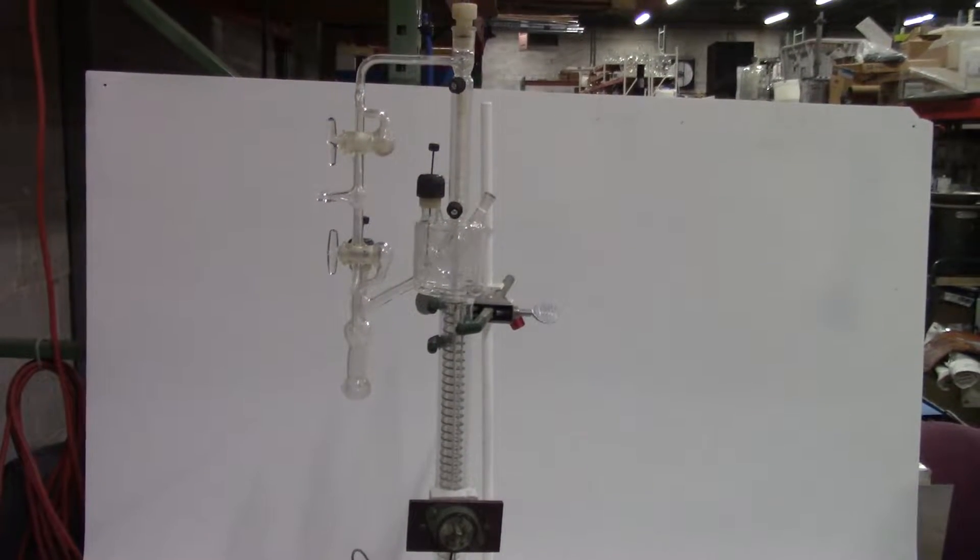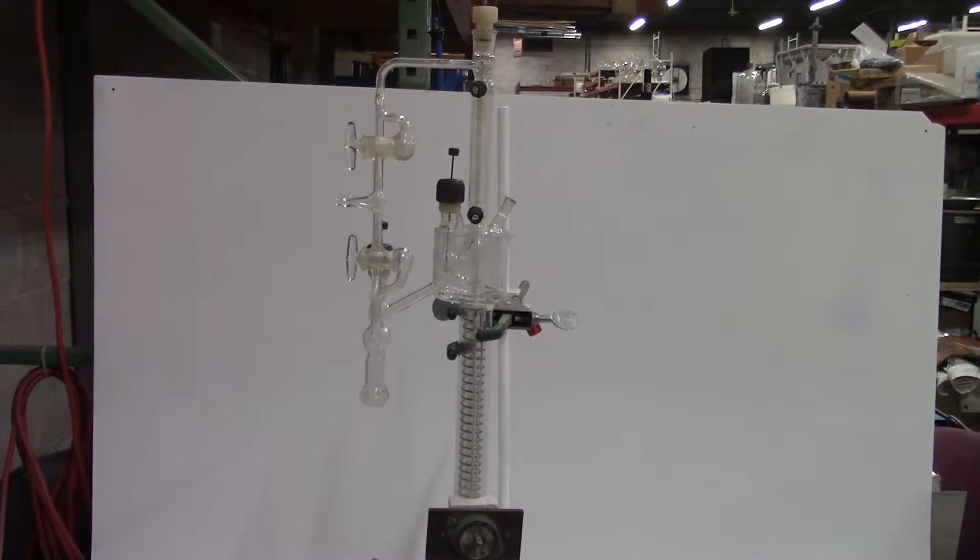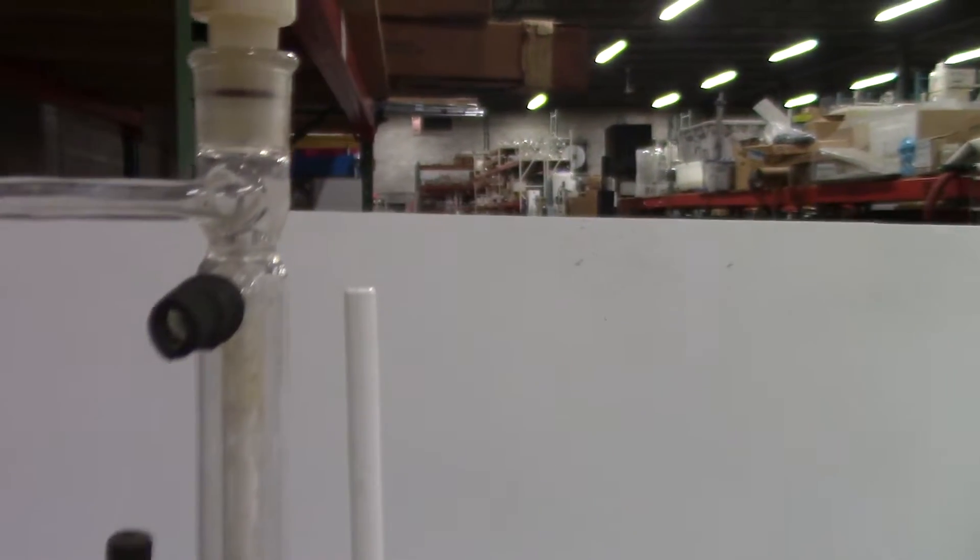Hi, this is Kevin from Hitechtrainer. We're looking at a spinning band distillation here. I want to give you a close-up look at the detail.